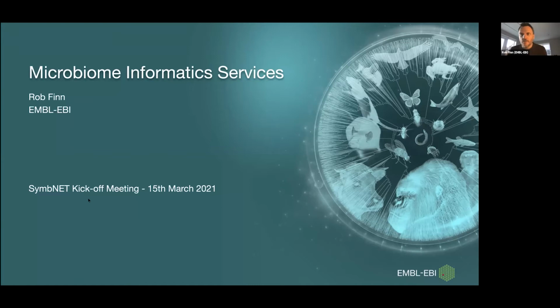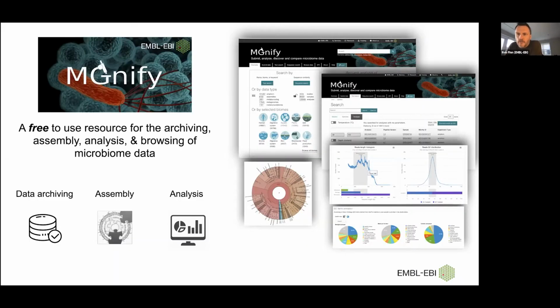Thanks very much for giving me the opportunity to give you a very quick introduction to the services we have from my team. So I run the Microbiome Informatics team at EMBL-EBI. I think Alex already alluded to this from my research team: my team runs the MGnify resource, which is a free-to-use resource for the archiving, assembly, analysis, and browsing of microbiome data.